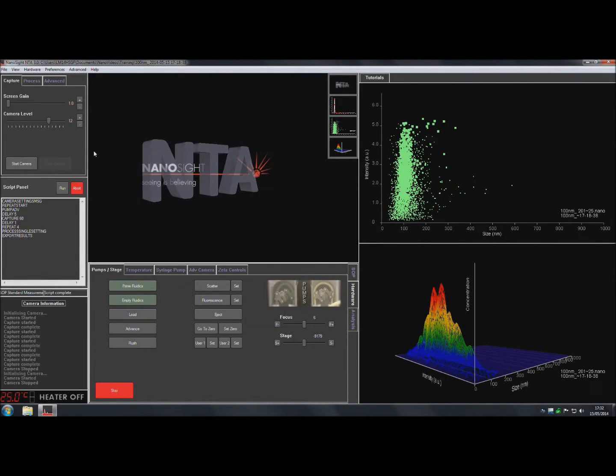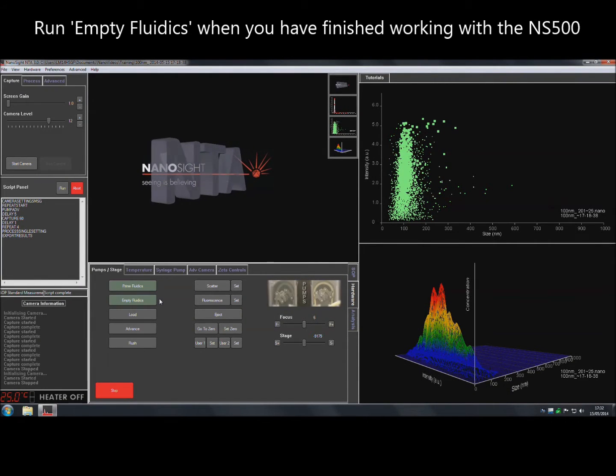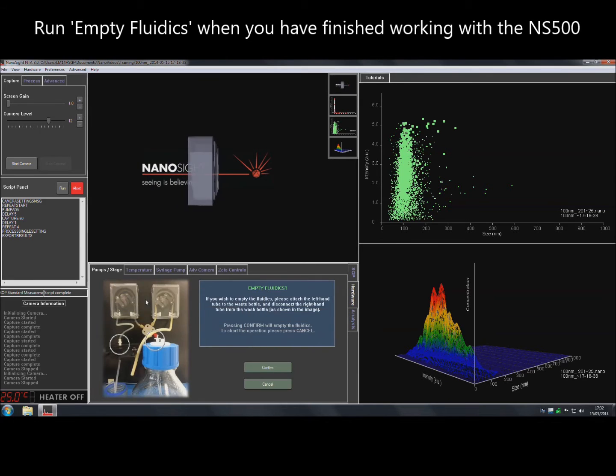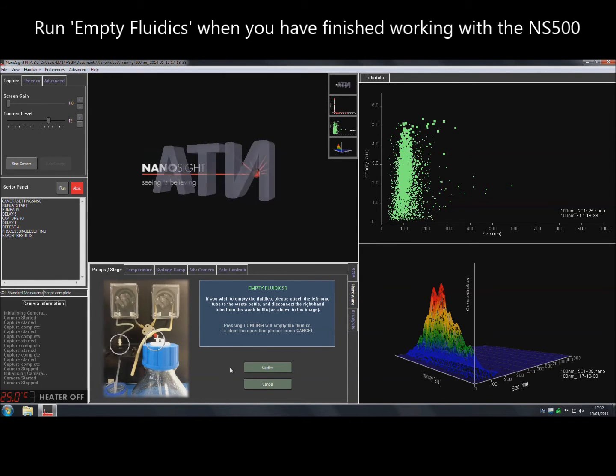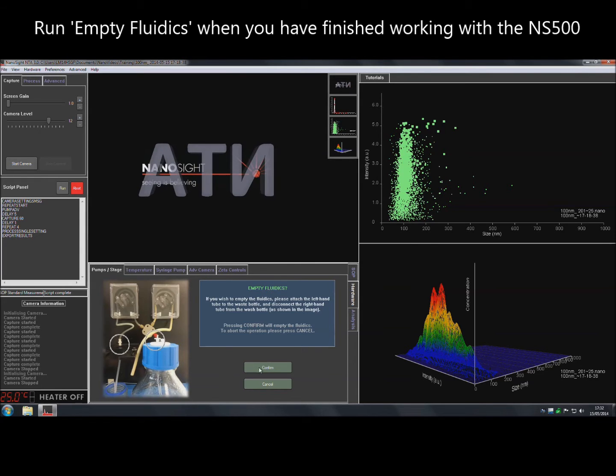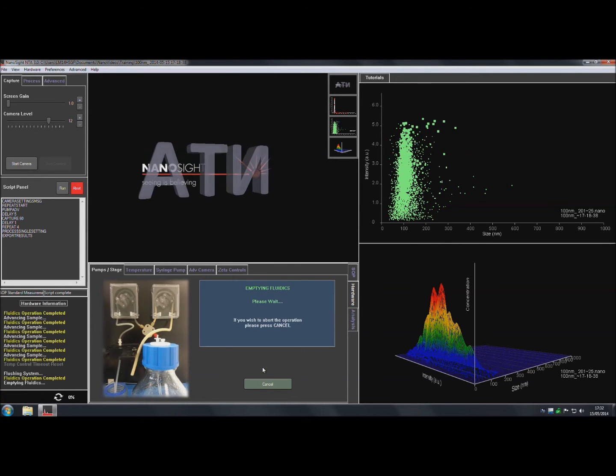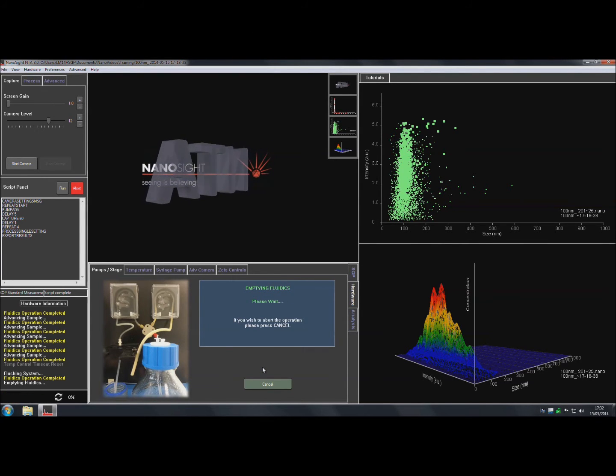When finished working with the system, select Empty Fluidics from the Hardware tab, disconnect the tubing as shown, and then click Confirm to remove all liquid from the tubing before shutting down the instrument.